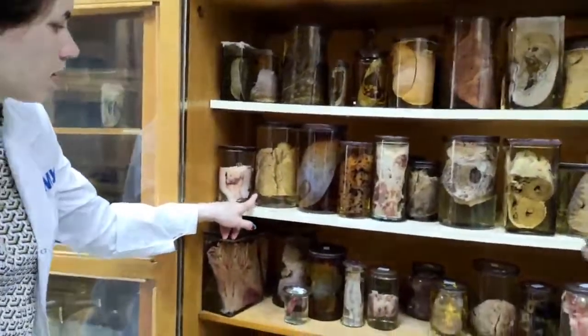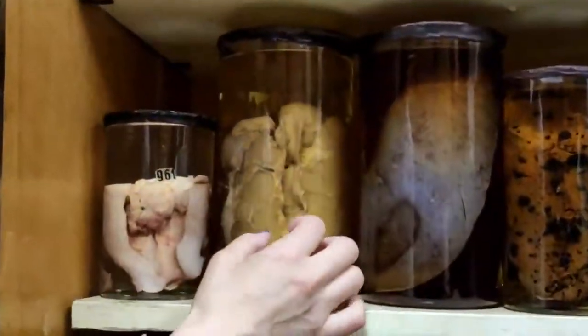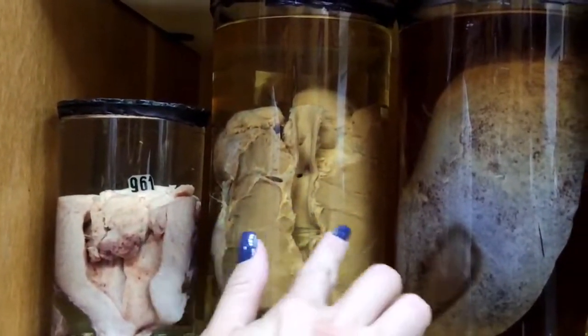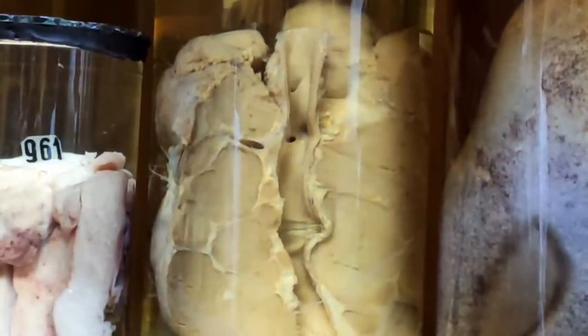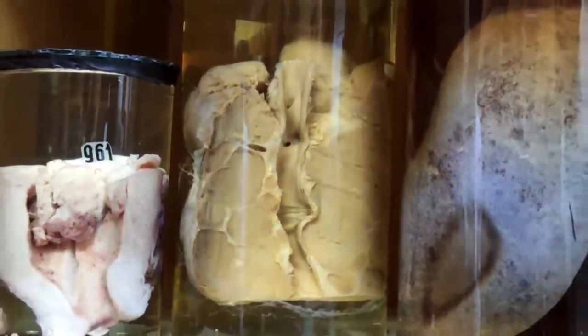Can come maybe closer. So this is aorta here, and on the left and on the right, from the aorta, you can see enlarged lymph nodes. And this is Hodgkin lymphoma, or another name of Hodgkin lymphoma, lymphogranulomatosis.